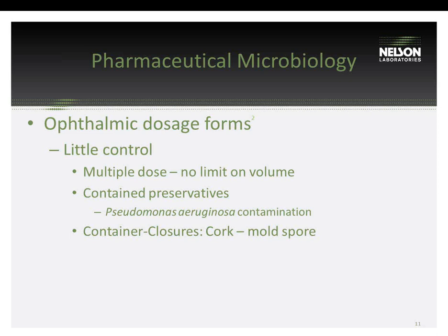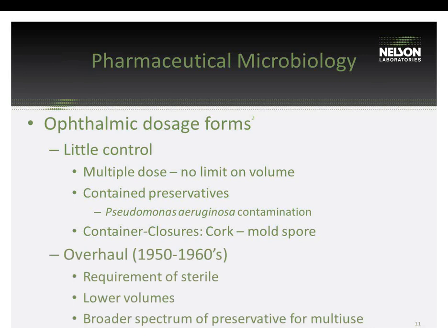And there weren't many regulations on preservatives. Mostly they were thought to have preservation just by low nutrients, but Pseudomonas aeruginosa is able to grow in that environment, and that caused eye infections. And if there was a cork closure, that's pretty much contaminating the sample with mold spores.